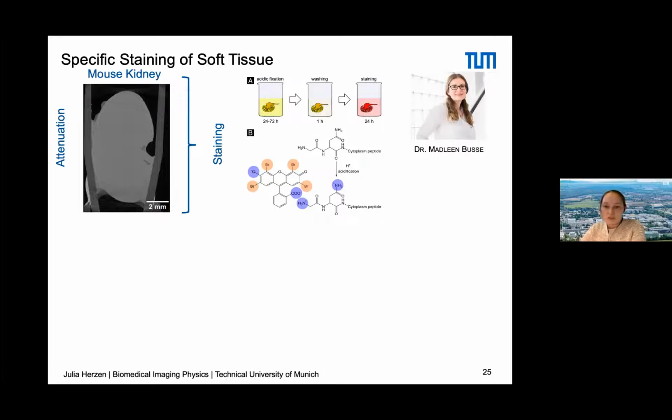That means they just go everywhere, depending maybe on the tissue density, how dense your tissue is and how heterogeneous it is, and sometimes also some chemical processes, maybe treatment of your sample, prevent the stain from entering the sample.